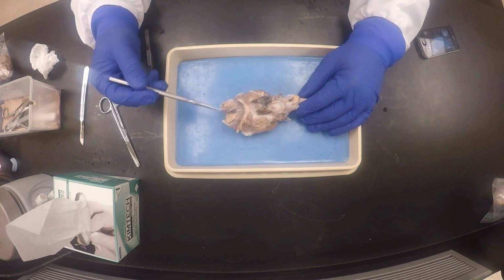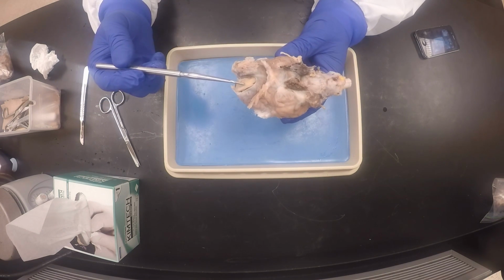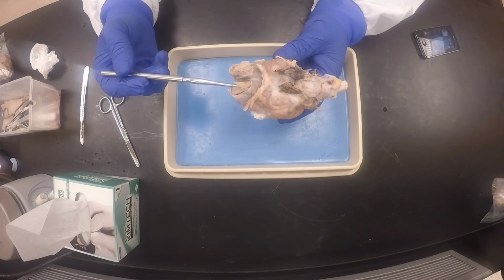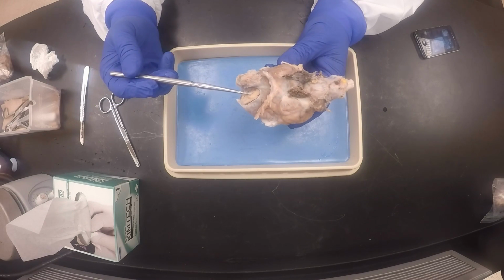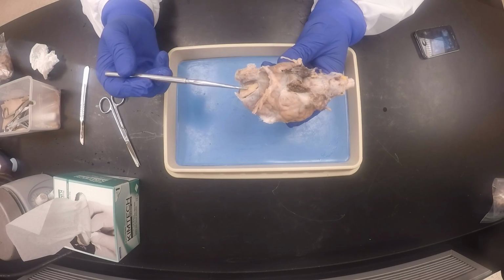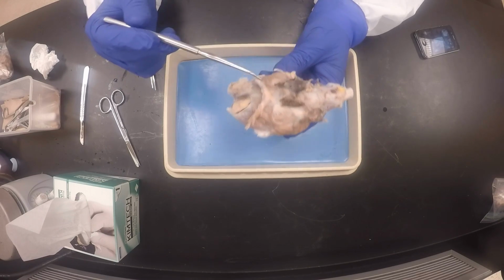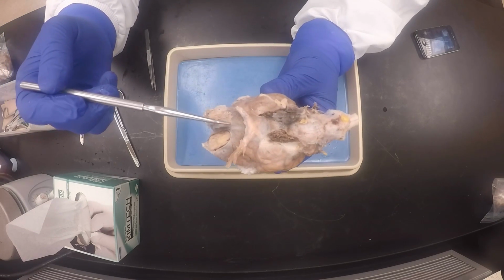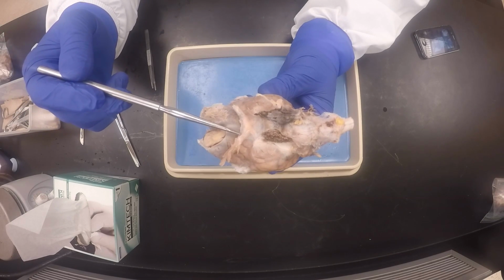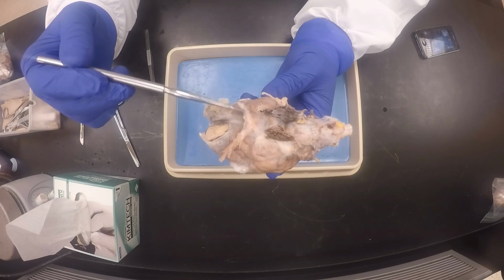So here on the front, you would see what is the remnants of the olfactory bulbs. You see, these are the olfactory bulbs. So this will be cranial nerve number 1. If I put a pin over here, this is the cranial nerve number 1, olfactory bulb. Then here, you see the one that crosses like that. That will be the optic nerve, cranial nerve number 2.